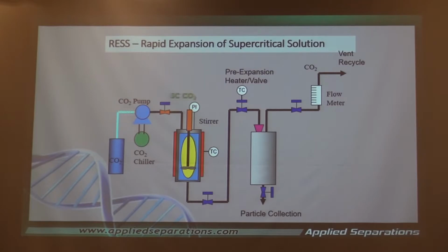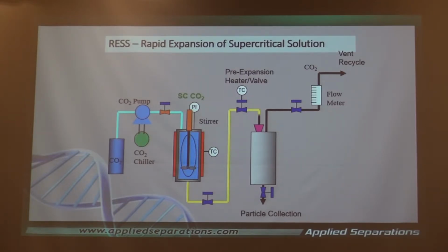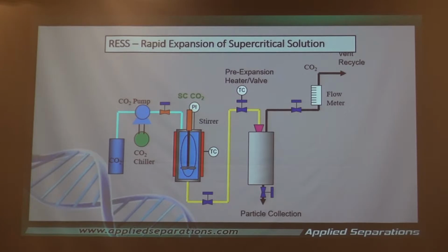So we bring in the CO2 at this point, and then the CO2 dissolves the compound, and then all we're doing is spraying it into an ambient state. Spray it in, and then we meter out, and the CO2 either gets recycled or it gets vented. Now, very straightforward.